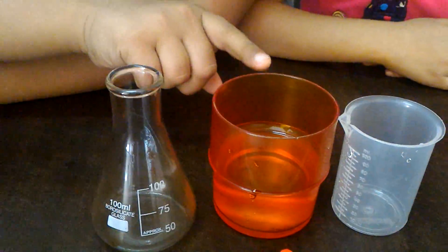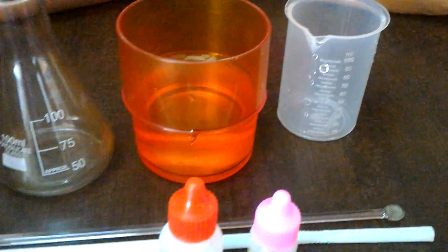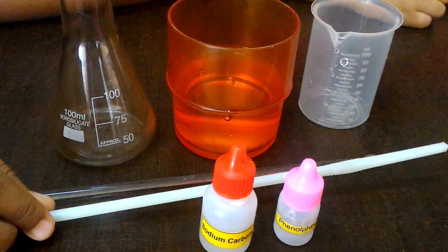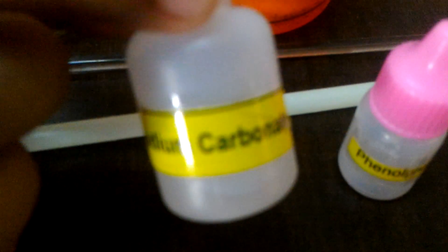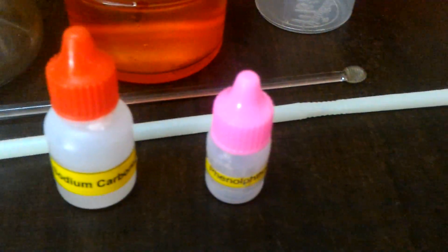The materials we require are a conical flask, some amount of water, a measuring beaker, a stirrer, a straw, a little amount of sodium carbonate solution — also known as washing soda. You can make this solution by adding washing soda and water, and then a little amount of phenolphthalein acid-base indicator.